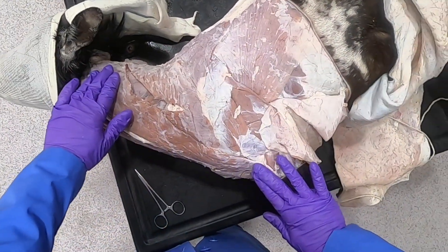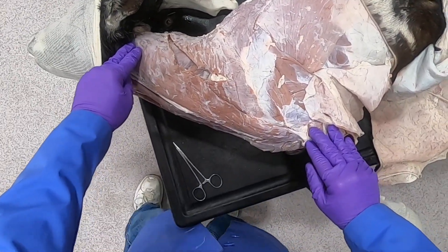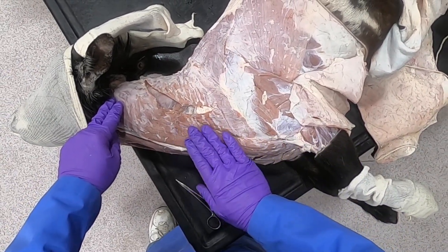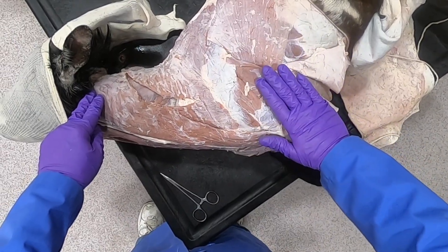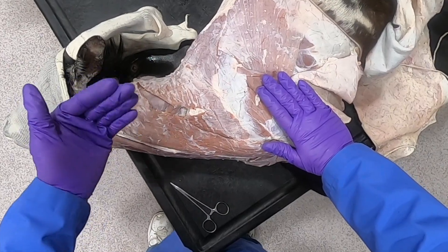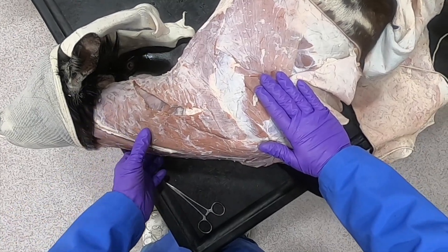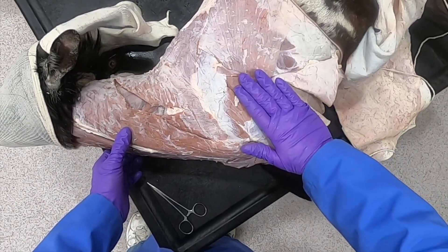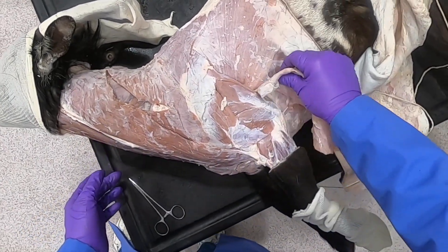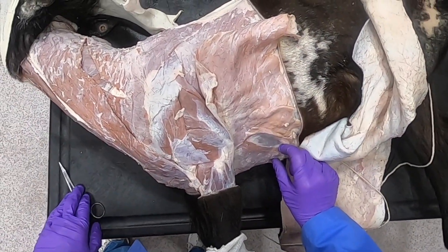Here we have a muscle going from the arm to the head — the brachiocephalic muscle. For the brachiocephalicus, we must determine whether the limb is planted or elevated for its action. If the limb is planted, it turns the head and neck unilaterally, or flexes the head and neck bilaterally. If the limb is elevated, it advances the limb. We can also see the deep pectoralis muscle here.